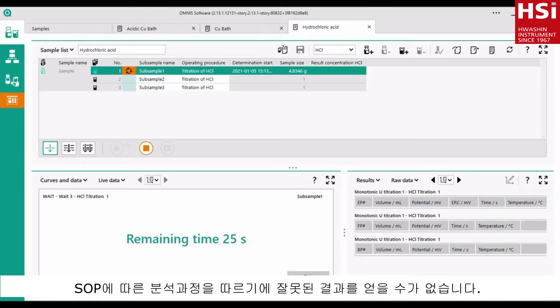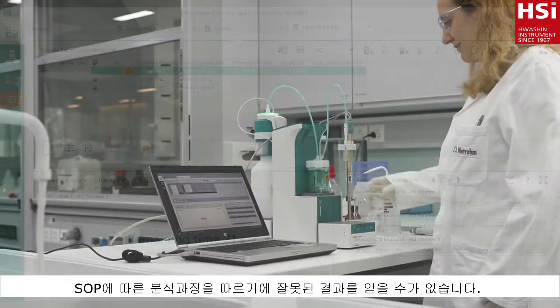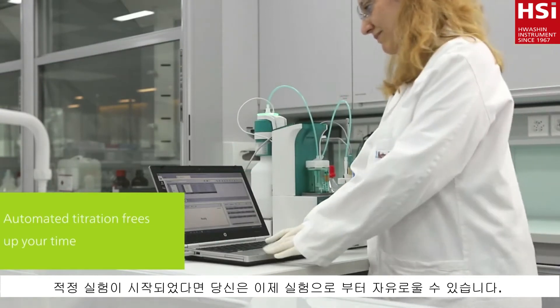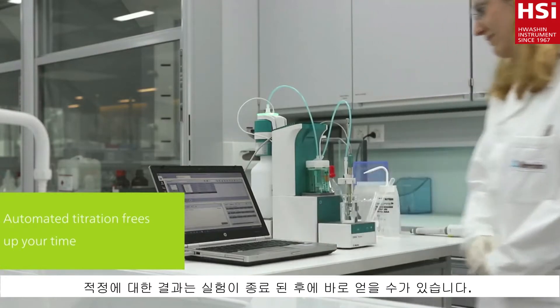You will no longer get wrong results because you missed out a step in the SOP. And once the titration is started, you are free to do something else while the titration is performed automatically.